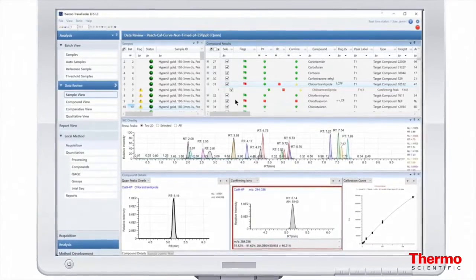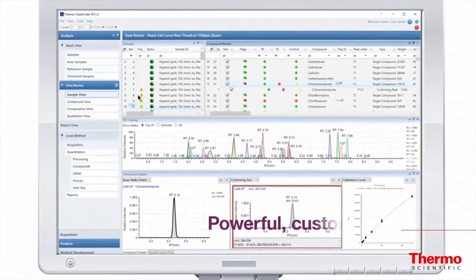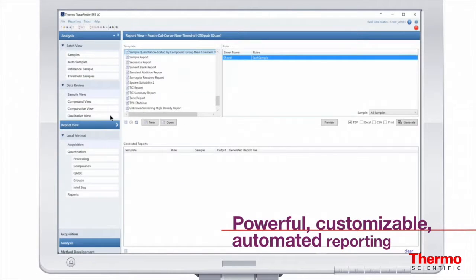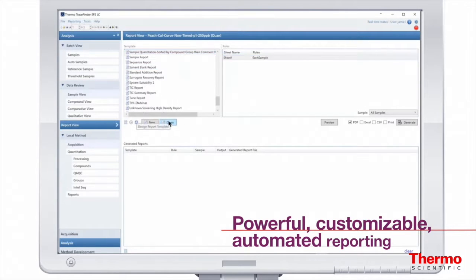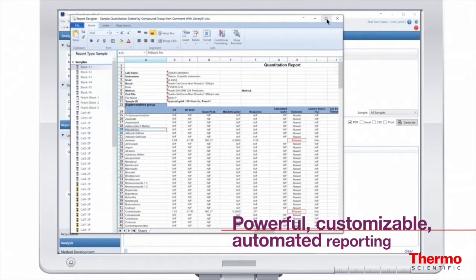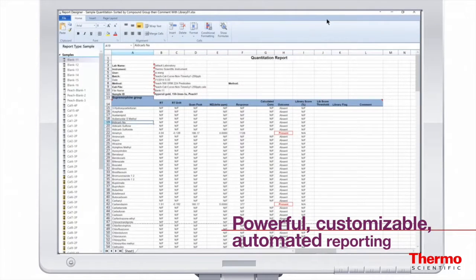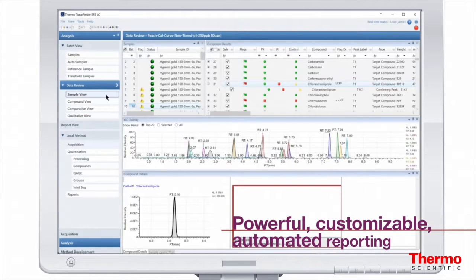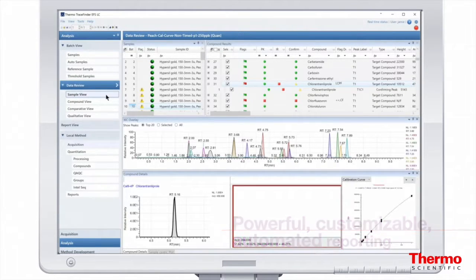Enhance laboratory productivity with automated reports and report templates. Applied for a variety of applications and across both HRAM and triple quadrupole MS, these customizable report templates offer additional flexibility to toggle between data review and reporting.